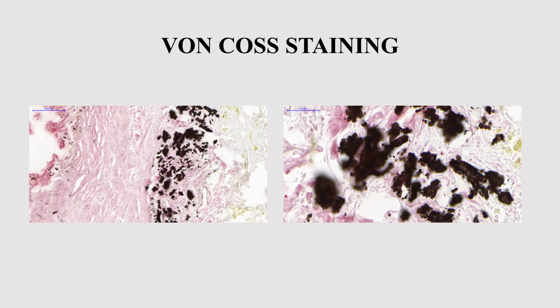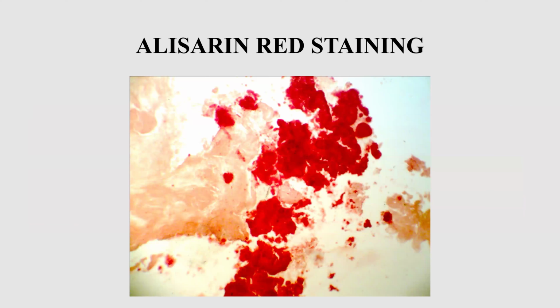This exposition under light and silver nitrates in tissues leads to the formation of a brownish, dark brown color of this deposition. Okay, it's quite an easy method, but it also needs a specific dye. It's alizarin red S dye.